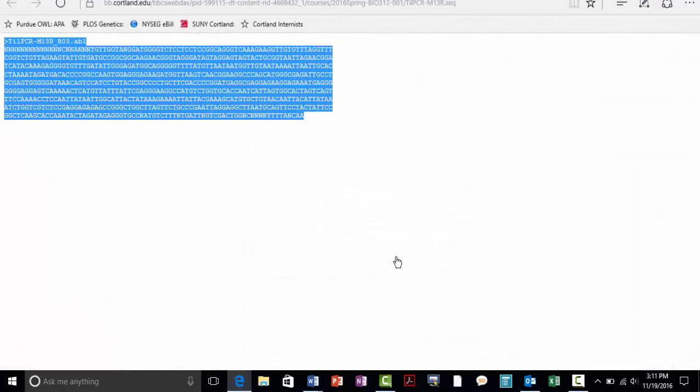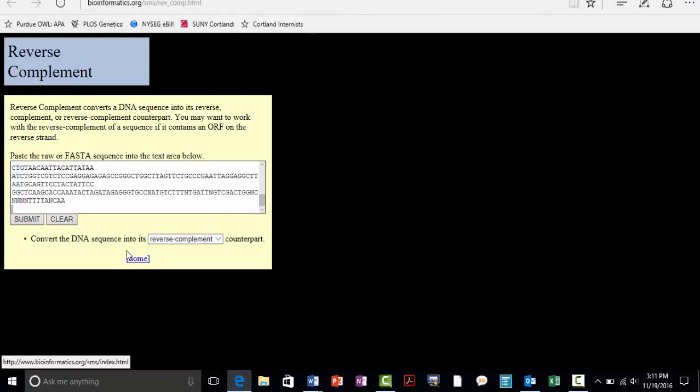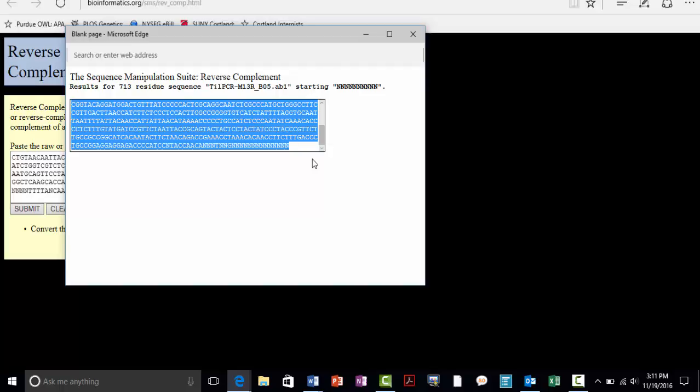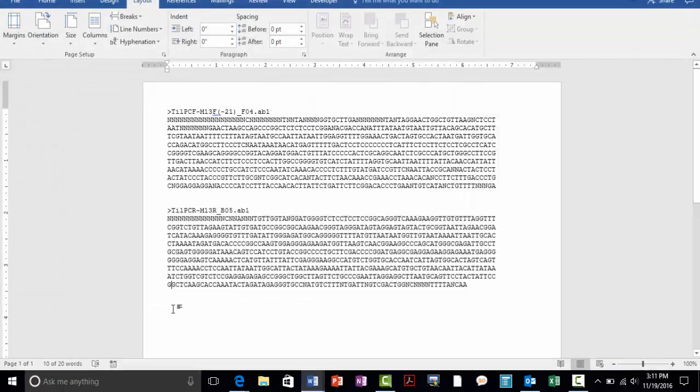So I'll go to the website and plug that in. And let's grab this. And we'll paste this in.